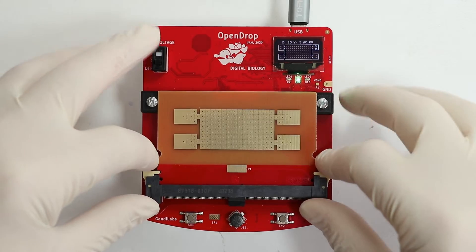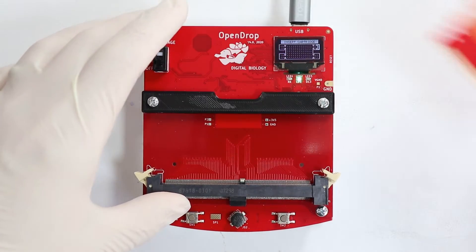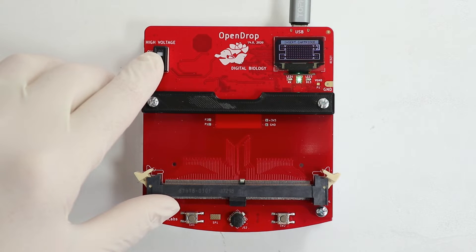To use the cartridge, the OpenDrop version 4 has a special cartridge connector. First make sure the high voltage is turned off.